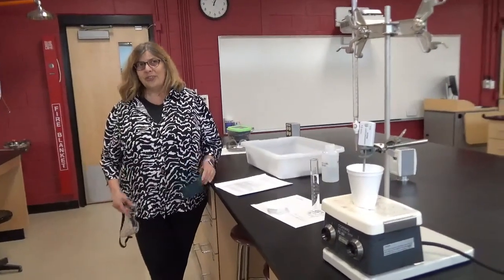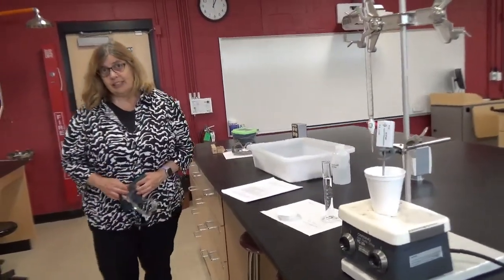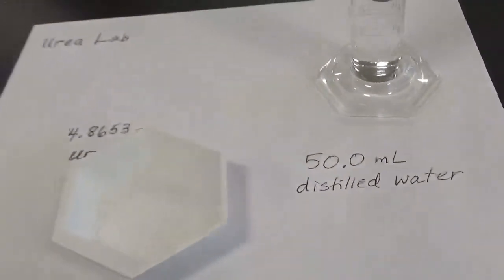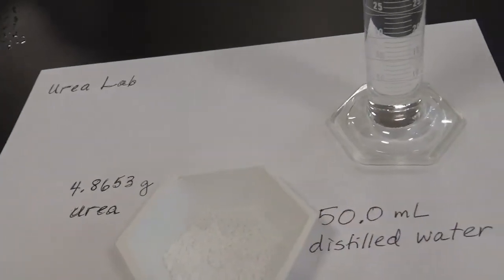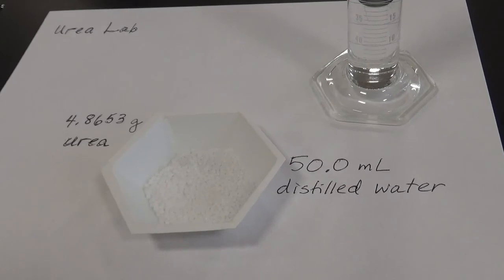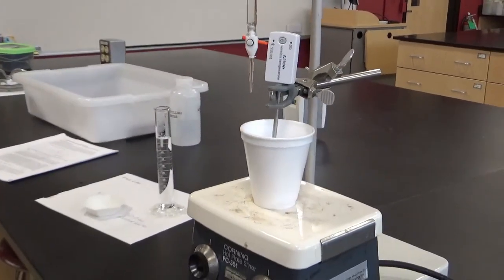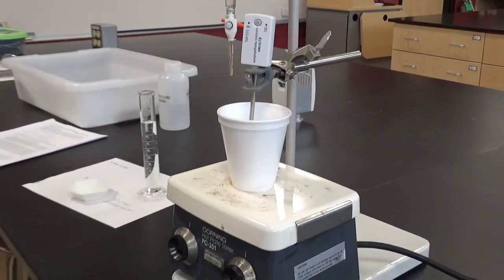And as you should know, dissolution means dissolving. So what we're going to be doing is taking a pre-weighed sample of urea, which is in this weigh boat, and we are going to be dissolving it in 50 milliliters of water, which I've also measured out into a graduated cylinder. And so we're going to pour the water into a styrofoam cup, as you see here. The styrofoam cup has a temperature probe in it, and we're going to measure the temperature of the water for a while.